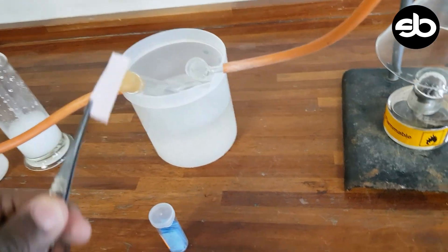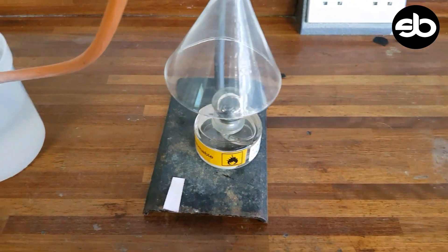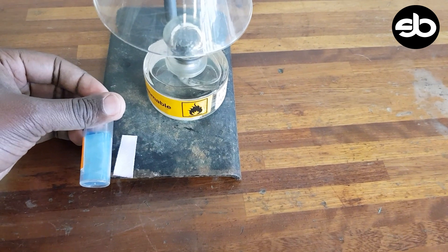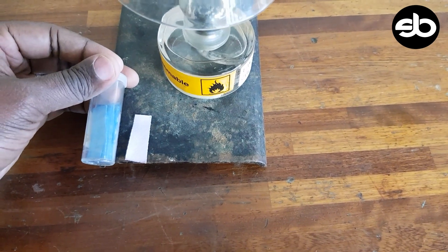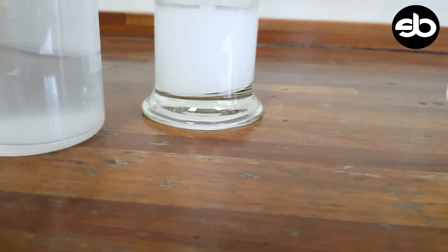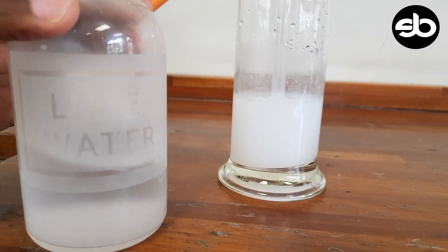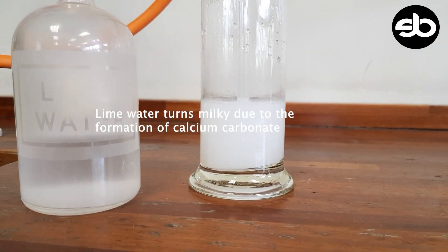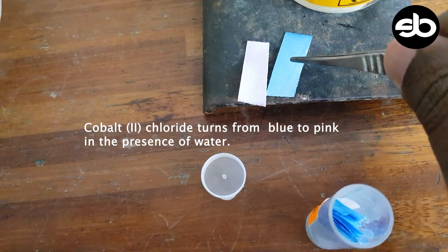I've taken the cobalt chloride paper out. Comparing it to its initial color, it has changed from blue to a pinkish color. The lime water, which was initially clear and colorless — just calcium hydroxide — has now changed color, and that is a positive test for carbon dioxide.